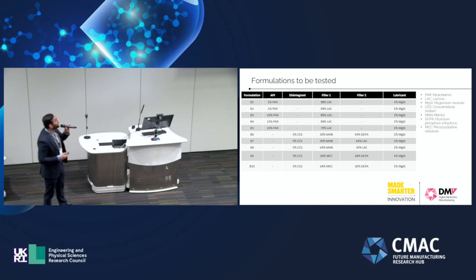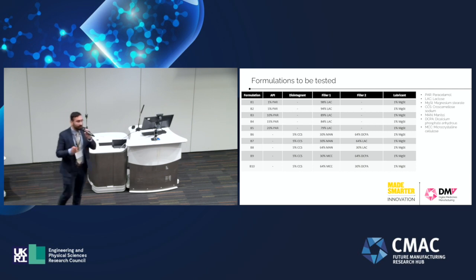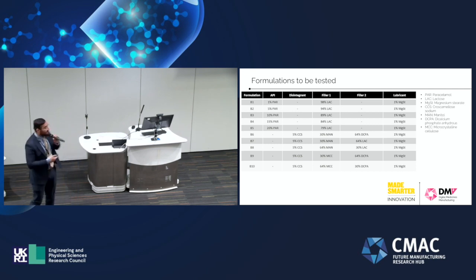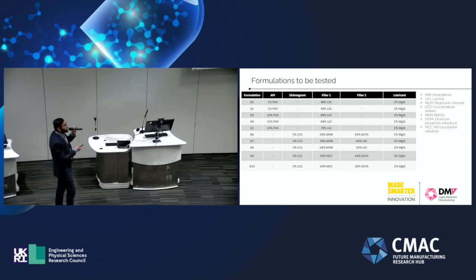So we have tested this system over a range of different formulations comprised of paracetamol as an API and a choice of different excipients like lactose, mannitol, DCPA, and MCC in different concentrations.